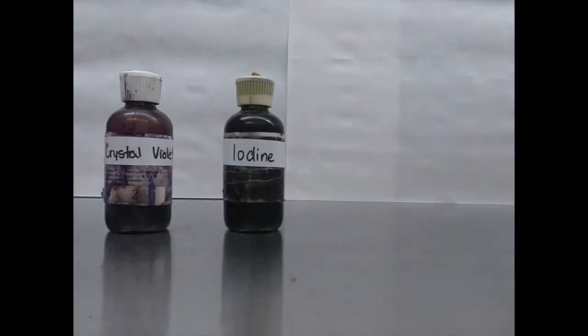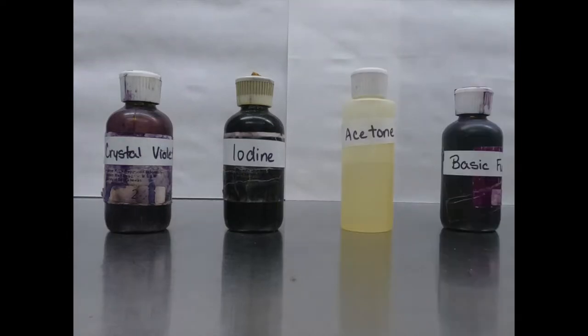There's four basic reagents required for a gram stain: crystal violet and grams iodine for our primary stain, acetone for decolorization, and basic fusion or safranine for our secondary stain.